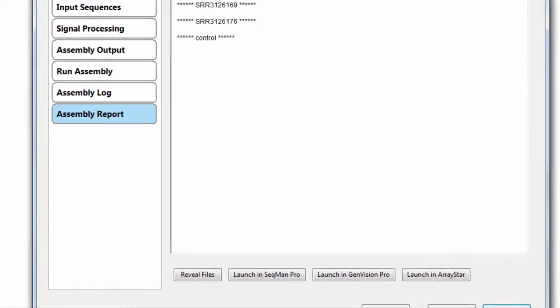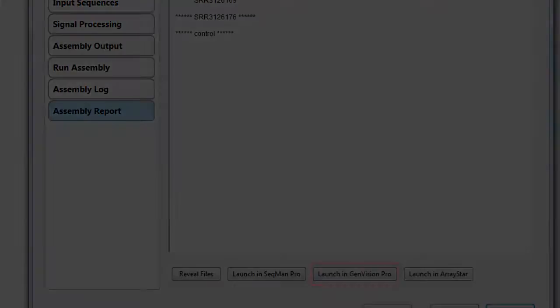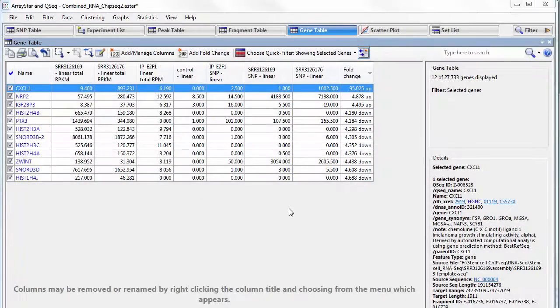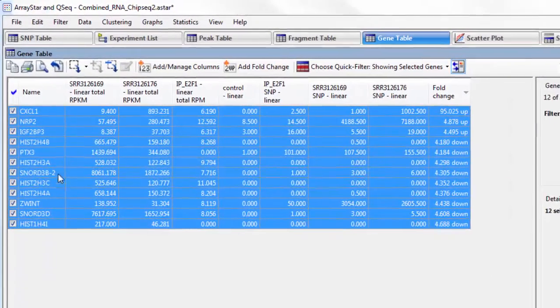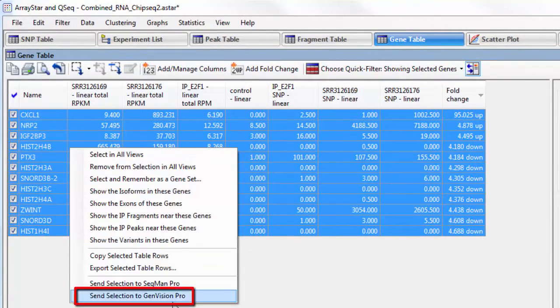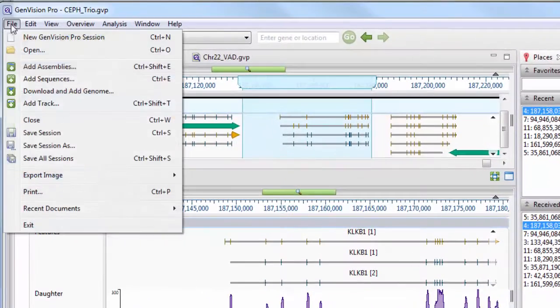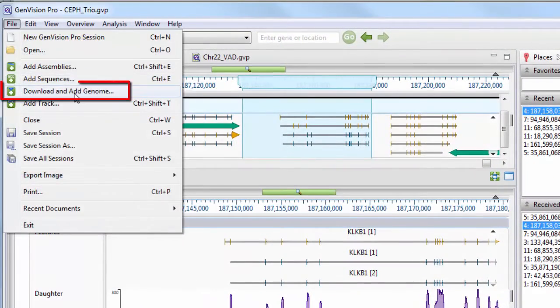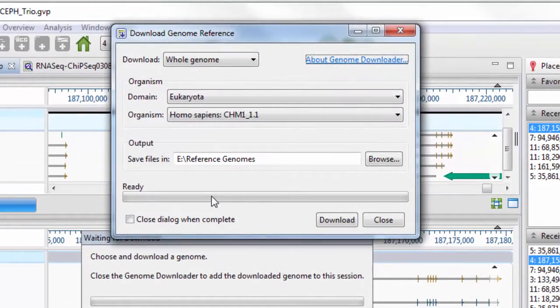Import genomic data directly from SeqManNGen or ArrayStar, making it simple to visualize groups of genes, peaks, or variants along the genome. You can also quickly import genomes directly from NCBI using our Genome Downloader.